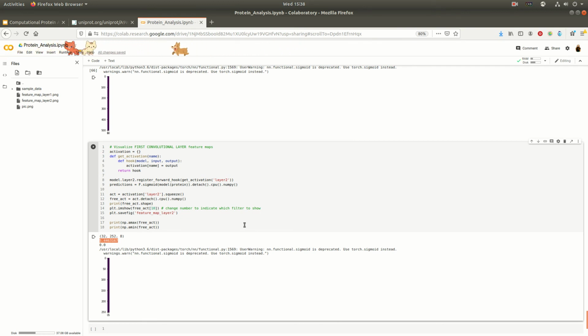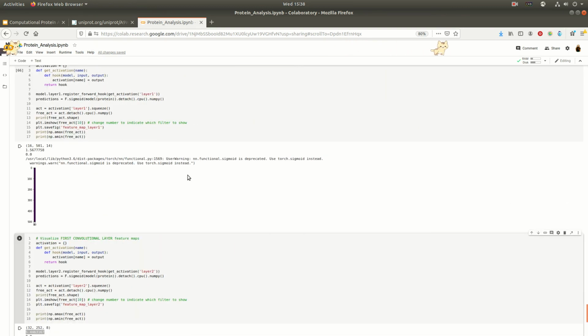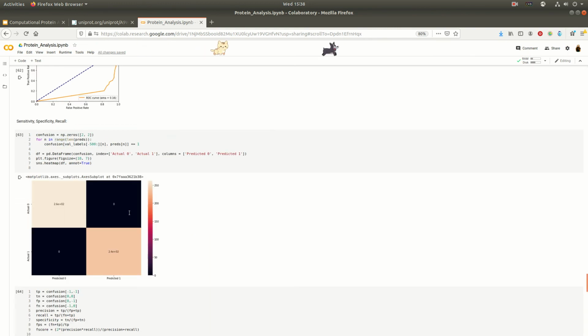So that's it, guys. I hope you don't have too many questions. If you really have a question, you can email me, email Dr. Pavlovic. She'll send it over to me. I'll try to answer your questions. Please feel free to play around with this code in your own copied version. It's okay if you don't know a lot of code. Just try changing little things and see what happens, right? Then you can start to get a feel for, okay, a little bit here and a little bit there. Does that make the model better or worse?